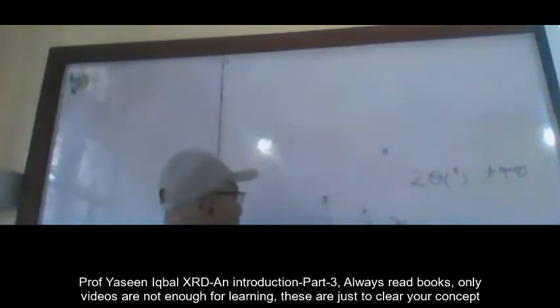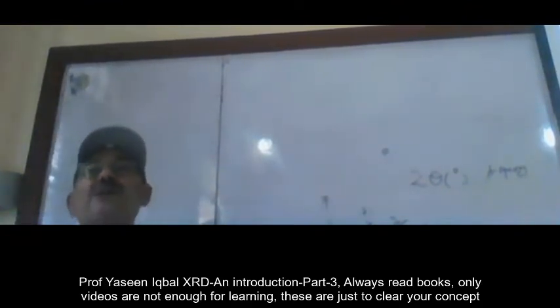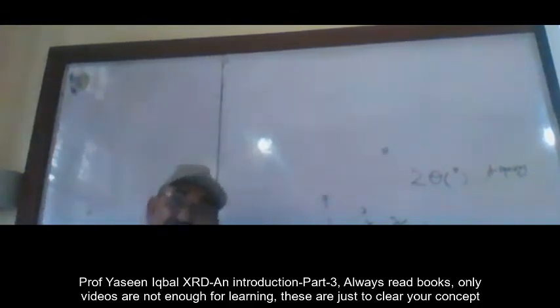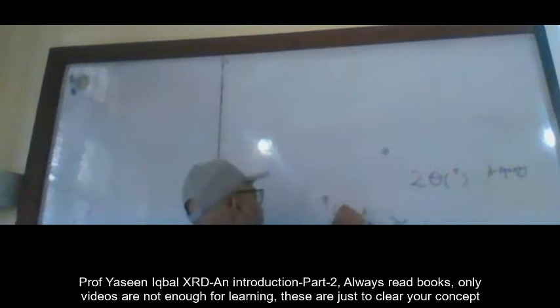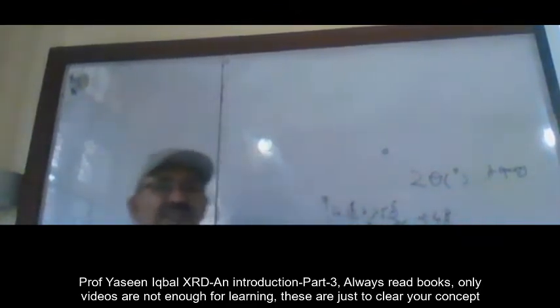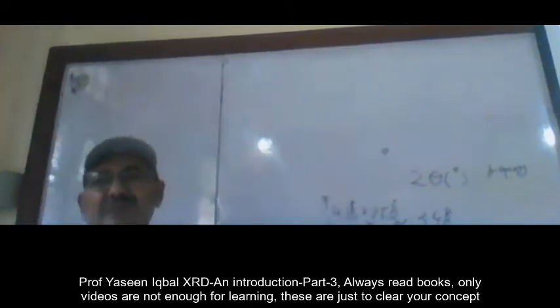Okay, when you have selected these peaks, then you order it to make a list of the peaks. Or there are softwares which label them in terms of the interplanar spacings: 4.1 angstrom, for example, 3.5 angstrom, 2.4 angstrom, like this. Some label them in nanometers, right?